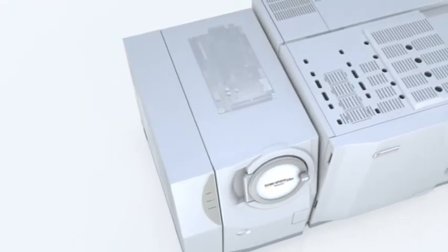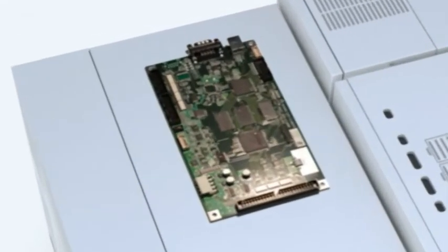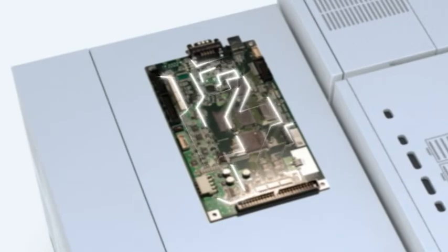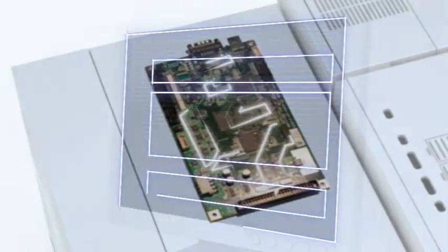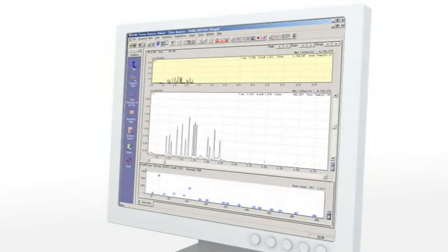ASSP is a firmware protocol that optimizes the ion transmission hardware parameters with a highly efficient data collection algorithm, allowing high mass spectrometer scanning speed and data collection.